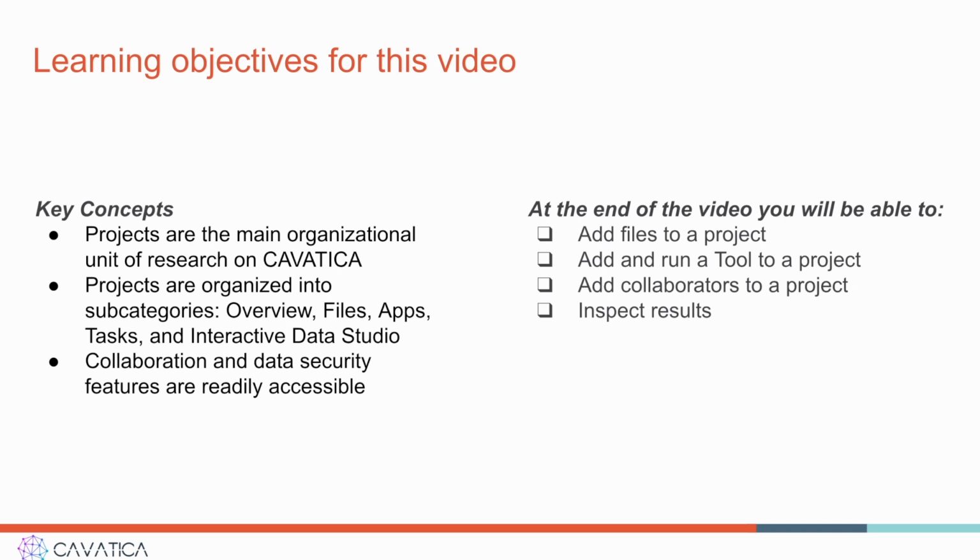The learning objectives for this video are to understand how projects are used as the main organizational unit of research on CAVATICA, that projects are themselves subdivided into dashboard or overview, files, apps, tasks, and interactive data studios. And finally, that collaboration and data security features are readily accessible.